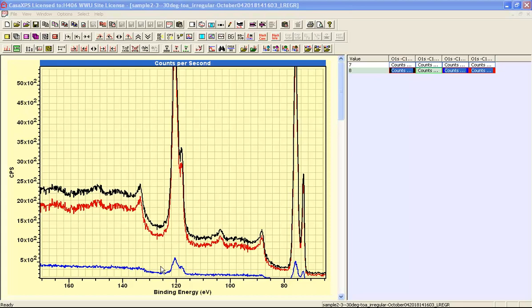Whereas the blue spectrum, you can see the aluminium oxide in the metal, but the plasmon peaks are blurred. So this suggests that we have some other scattering process that's going on in addition to what you'd expect for a layer of aluminium oxide on metal.